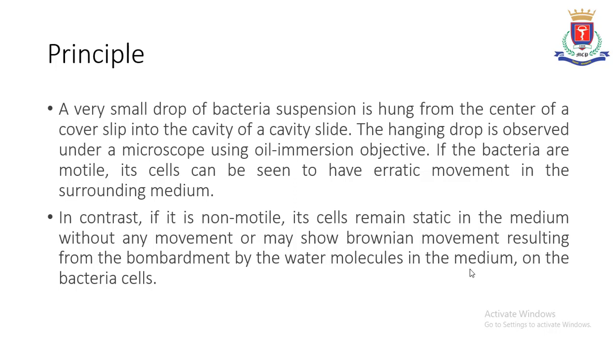Now the bacteria are usually divided into two classes. First is the motile bacteria and the other is the non-motile bacteria. Motile bacteria are the bacteria which can move from one place to another with the help of flagella or any other organs for locomotion, whereas the non-motile bacteria cannot move from one place to another.